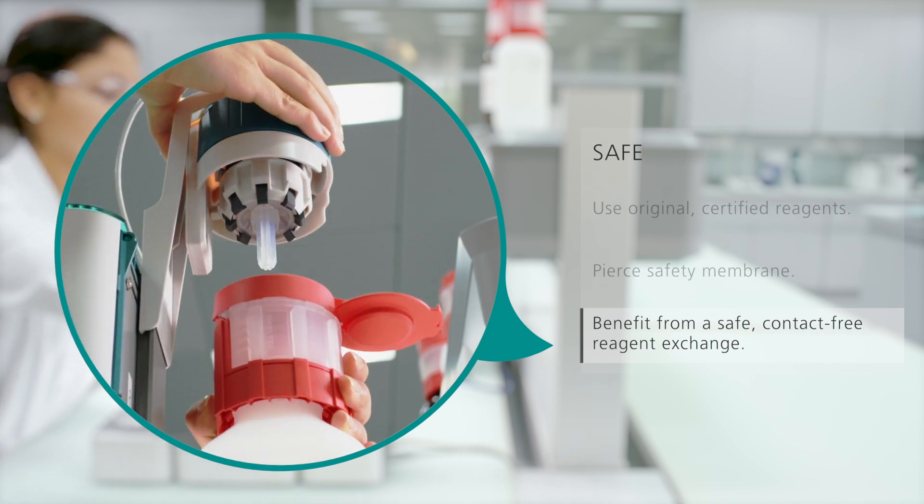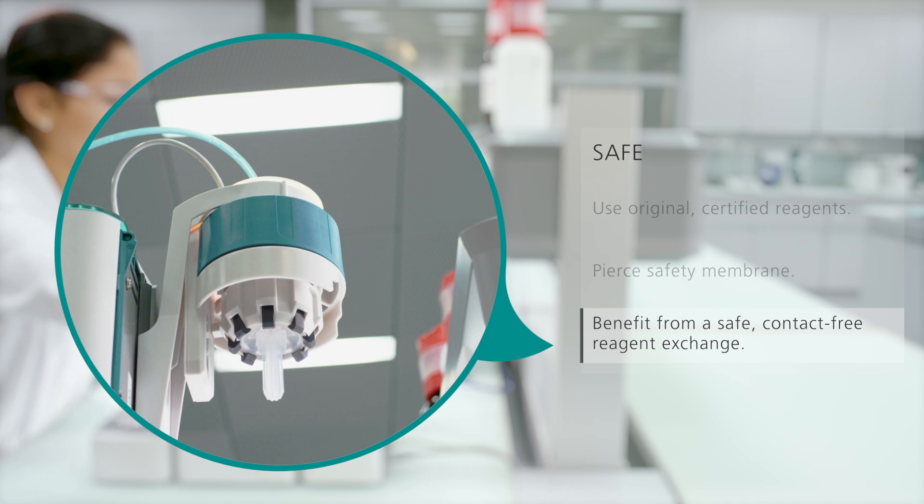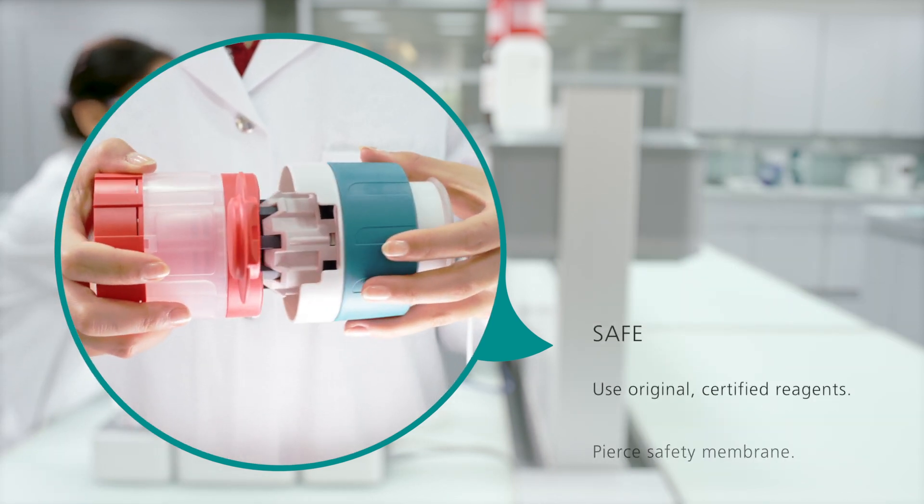The Omnis liquid adapter connects the reagent bottle to the Omnis titrator, making titrations safer than ever.